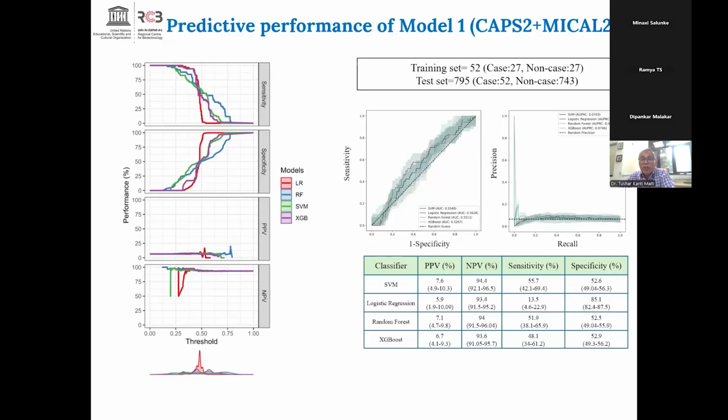We expect high sensitivity and specificity. That means if our sensitivity approaches 100 and specificity also approaches 100, this is the ideal condition, and if we achieve it, then we can say this will be a good test. And second, for the low positive predictivity, one could ask why we are getting 7.6%. It is because the cohort, as we mentioned, is a combination of case and non-case.